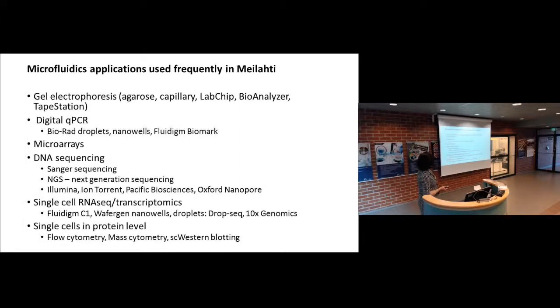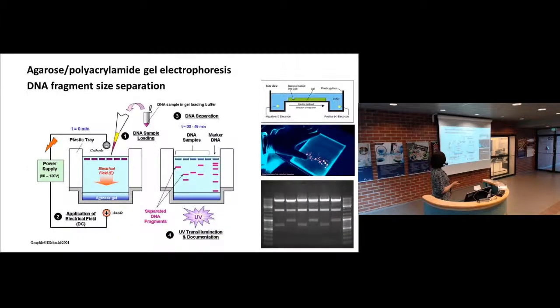And then my lab is especially focused on single cell RNA-seq, and I'll talk about those platforms. And also at the protein level there are new, very interesting devices to do single cell proteomics. But first, about everyday gel electrophoresis.